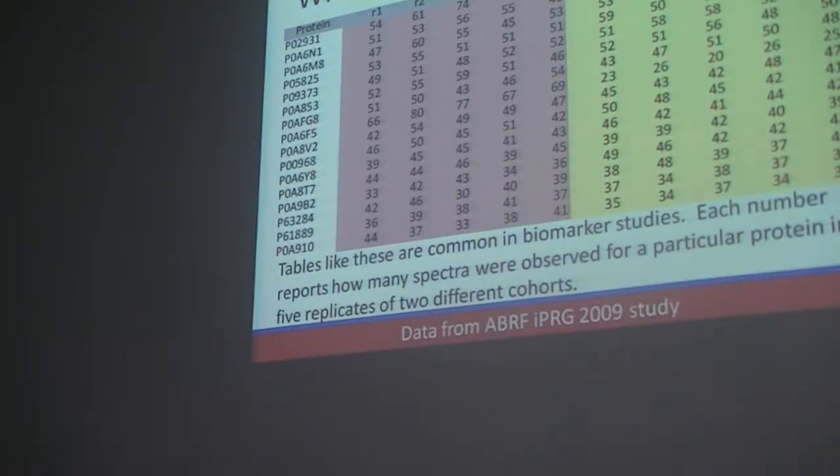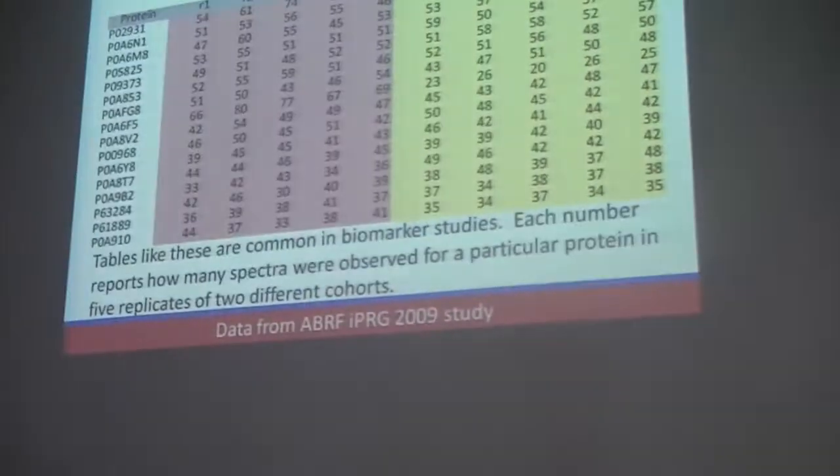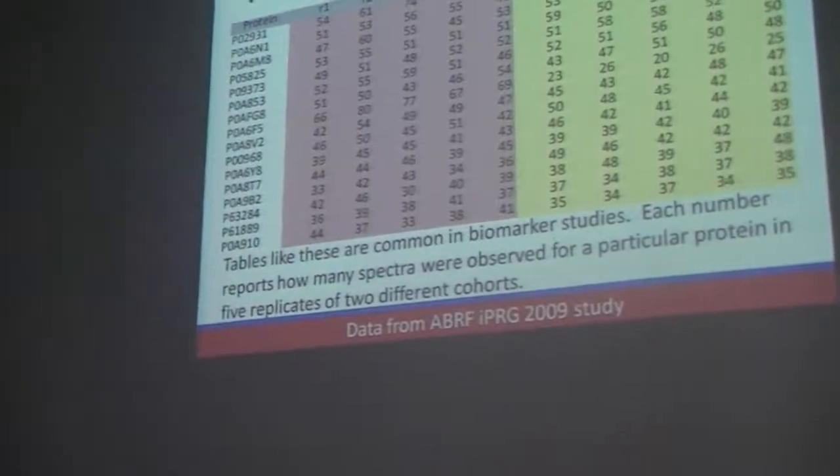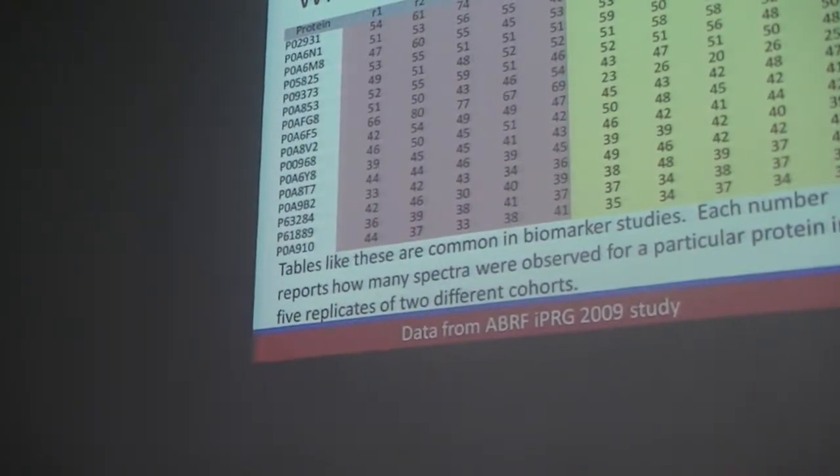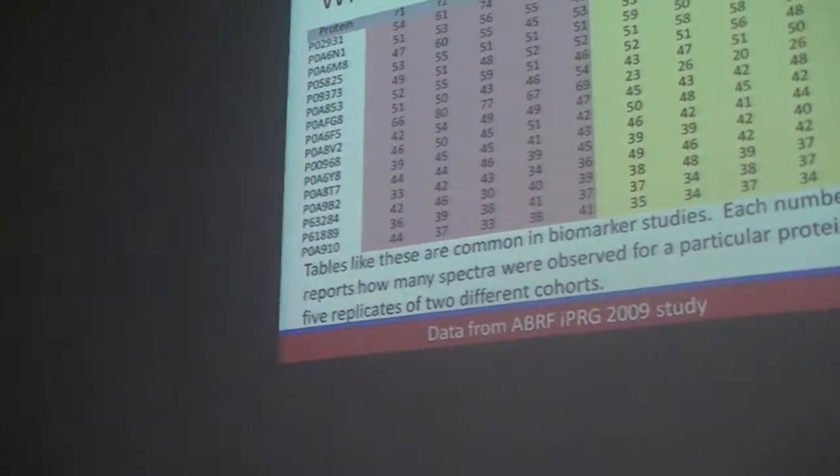That's really good. Well, what is the variance within red and within yellow? 0. 0. Right. Yes. There is no variance. 0. Those are correct answers. So if you cannot estimate variance correctly, you've got a real problem. And spectral counts, when the numbers match across the board, there's no minimum on the variance that you get from that. The variance of 2, 2, 2, 2, 2 is 0.